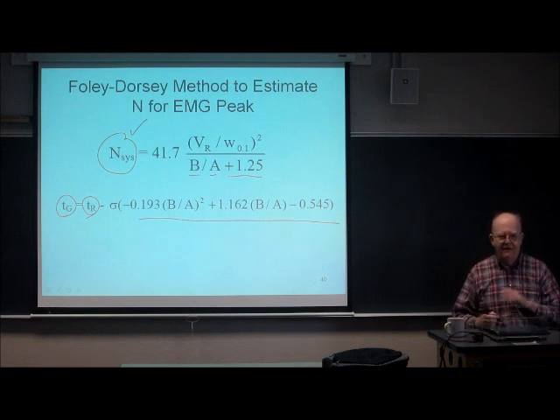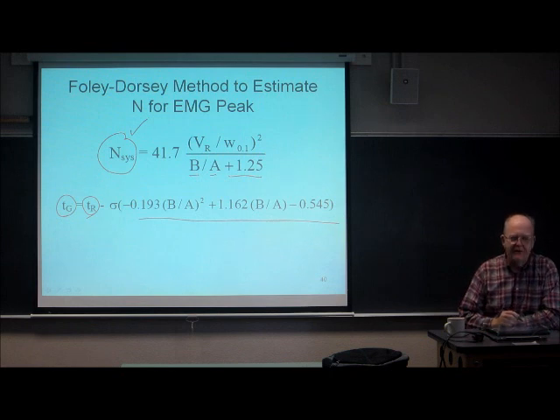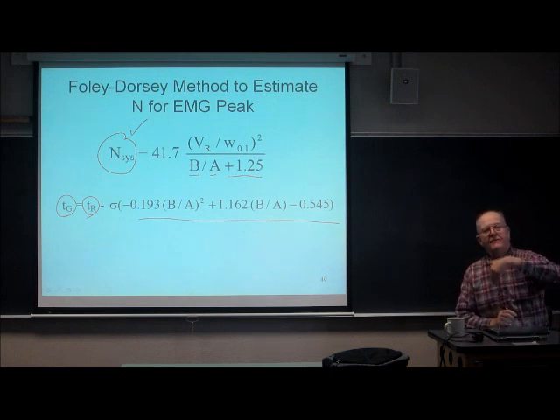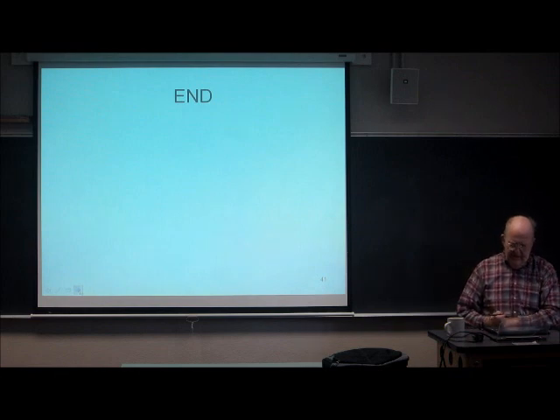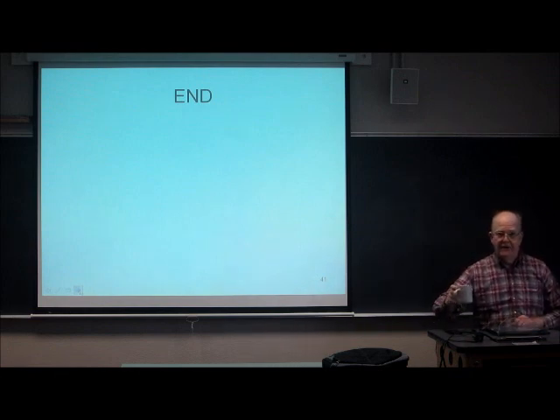You can do that. Those are not defaults. You have to go in and consciously make it happen that way. Okay, that's the end of extra column broadening.